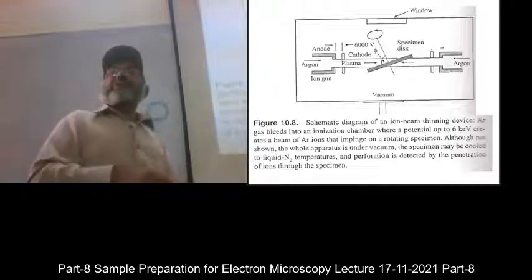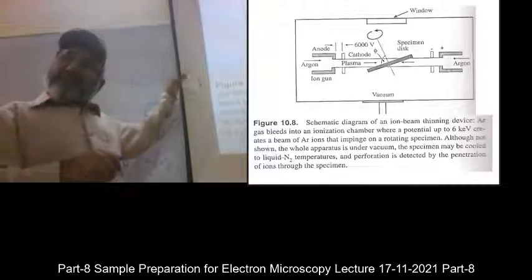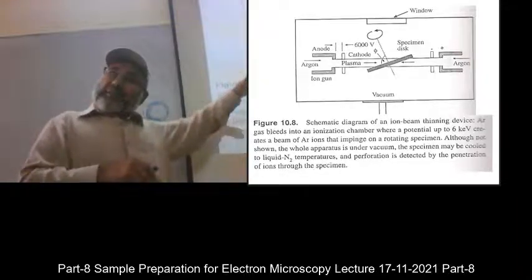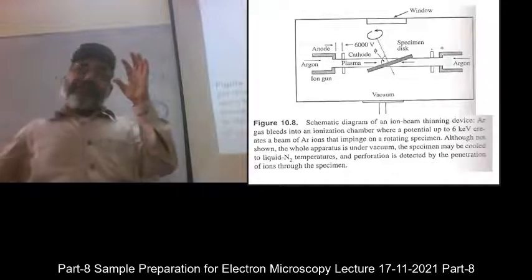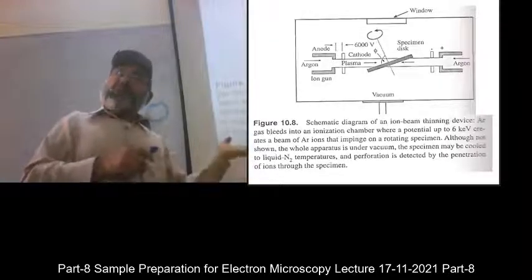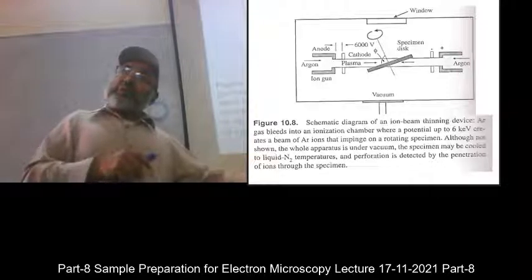In situ transmission electron microscopy means that you have the facility in the machine to heat the sample inside it and see the phase transformation. You focus a specific diffraction pattern, then heat it, and you see how the structure changed. And the same happens with the cold one, at which temperature do you want to look into a sample.